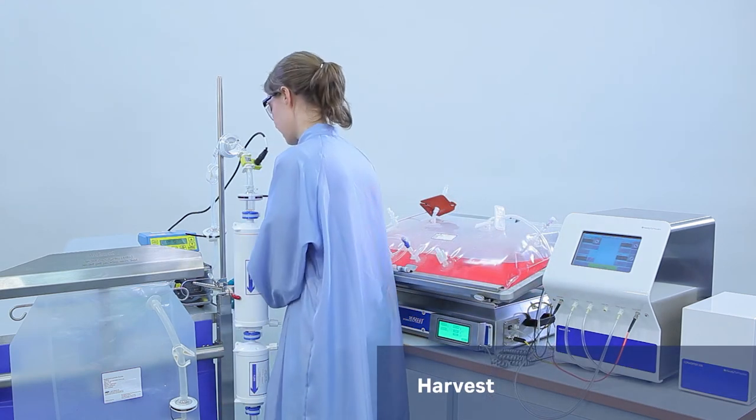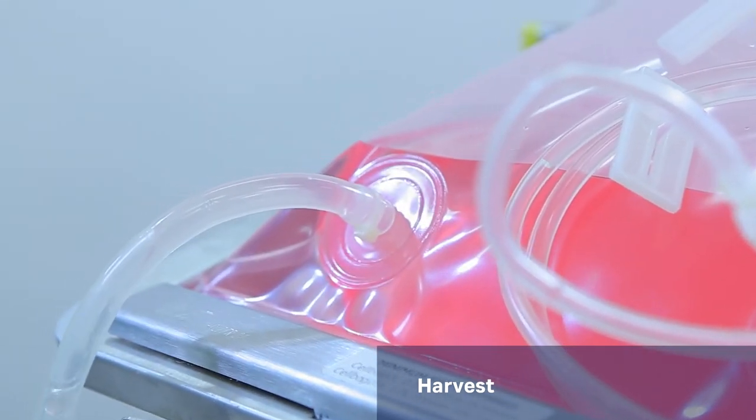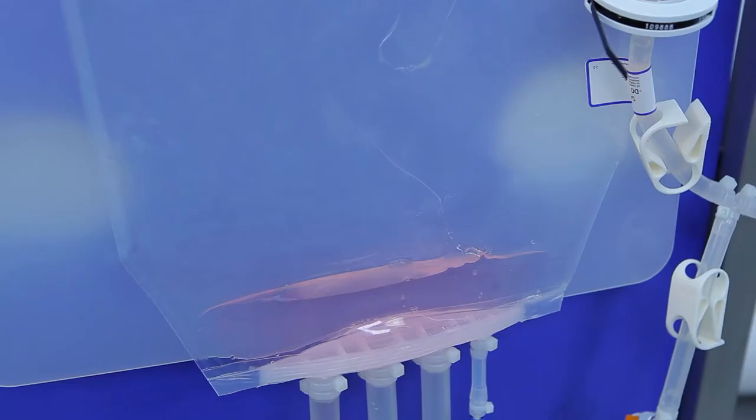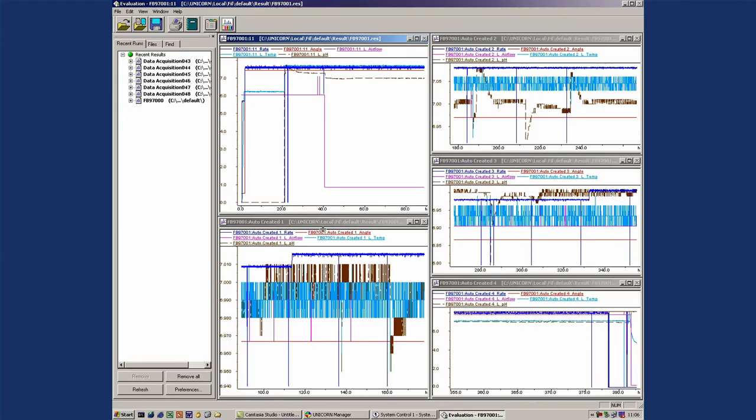When cell cultivation is done, harvesting is easily performed by fusing or connecting the cell bag to the appropriate clarification device. The cell cultivation data can be analyzed using Unicorn DAC. A result file is generated and the Evaluation module offers facilities for presentation and evaluation of the curve data.